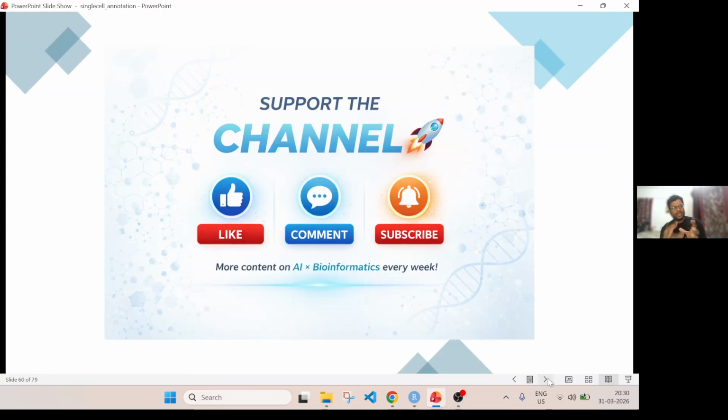Okay. I hope this CellTypist gave you some idea that if you have the option to try an ML based method, you can try it out because these are trained against reference data sets. It is easy and very fast as well. SingleR is more correlation based, right? So there is not much statistics there, but with an ML based method, you may get better accuracy. So it's worth trying. That's why I thought to include that approach as well.